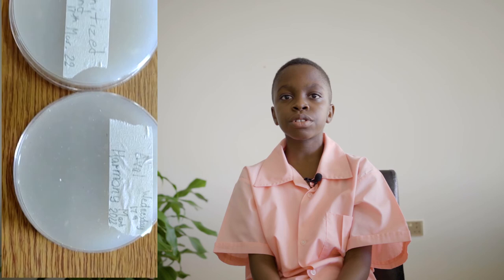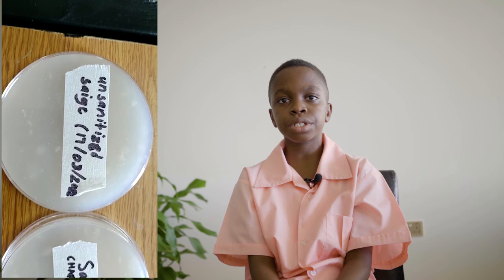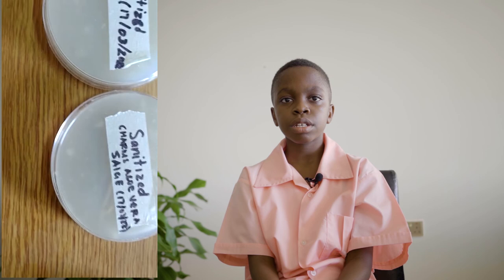To make our experiment better, we should use a wider range of sanitizers. The mold grew because of the condensation in the plates. It would be better to control the temperature where the plates are stored and remove the water inside the plates.